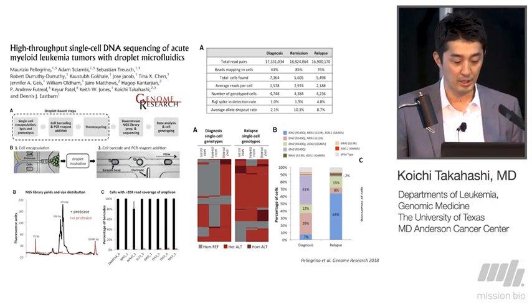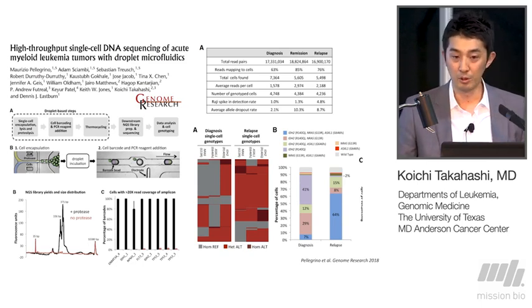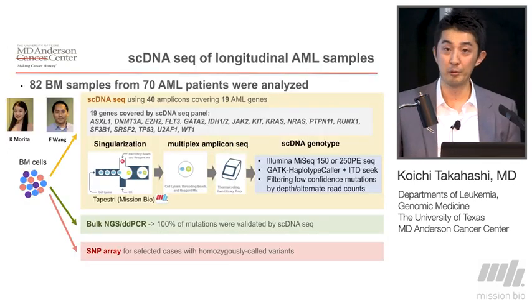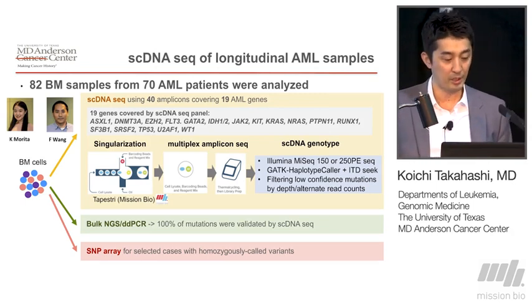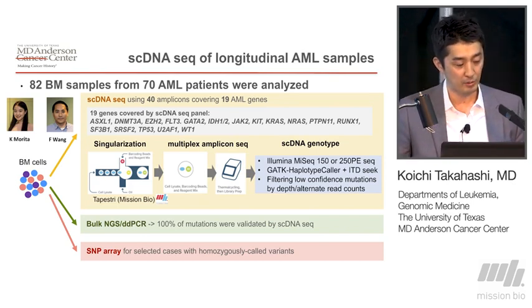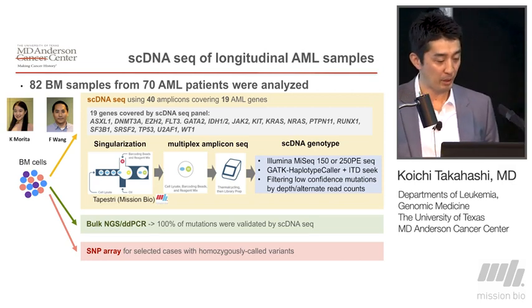And we show that in this first pilot case, where we had a diagnosis sample and a relapse sample, we clearly saw the clonal heterogeneity at the beginning and also the remodeling of this clonal heterogeneity at the time of relapse. Since we were very happy with this pilot collaboration, we expanded this effort to larger-scale sequencing data. Most of this work was done by two postdocs in my lab, Dr. Morita and Dr. Wang, who performed the bioinformatic part.